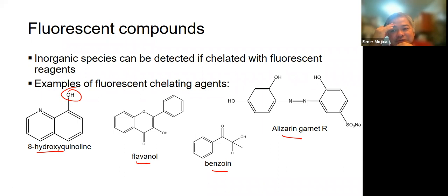I have this fluorophore. I still remember the name because its name is really popular now, yung tinatawag na Alexa. So I have Alexa Fluor 488. I use it to tag an antibody, and I try to determine the emission properties. Okay? Because when it's not tagged, hindi fluorescent yung material. So when you tag it, what happened? Your fluorophore is attached to that biological system, so you can monitor its property.